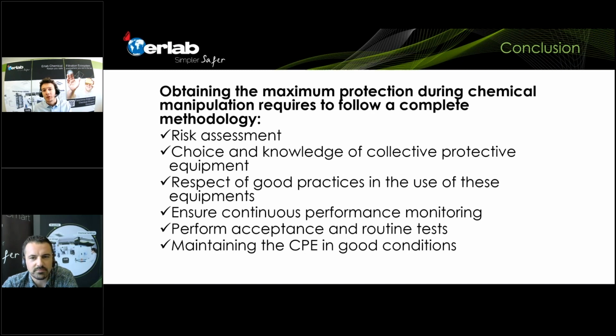So, of course, when you use a lot of different chemicals in the lab, you will not be able to use all of them at the same time in the same enclosure. So what we recommend is, of course, look at what's the most useful for you. When you work in the lab, the first thing is safety. So you need to think about safety in the first place. But of course, as well, what's the best way to operate? What's the easiest way to do your manipulations?